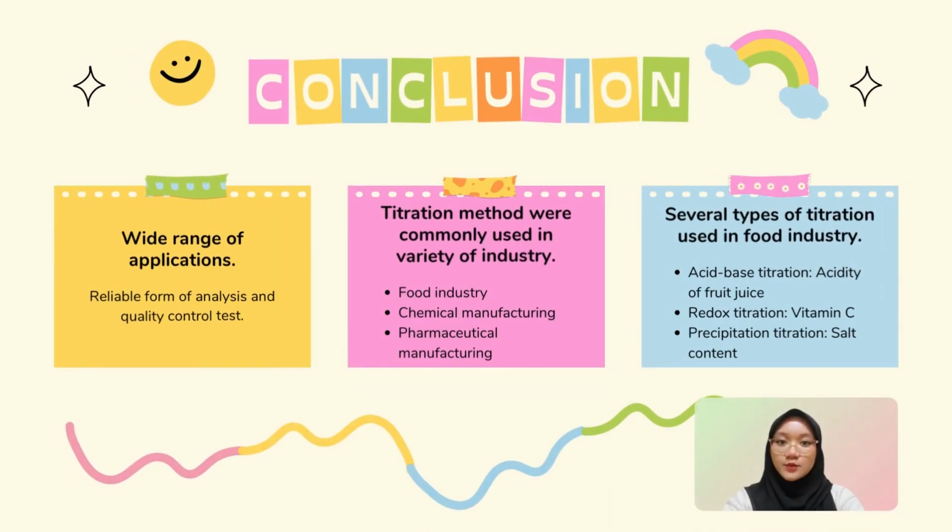As the conclusion, we learned that titration is a volumetric analysis that can be proven to be a very useful method for testing substances in everyday use.